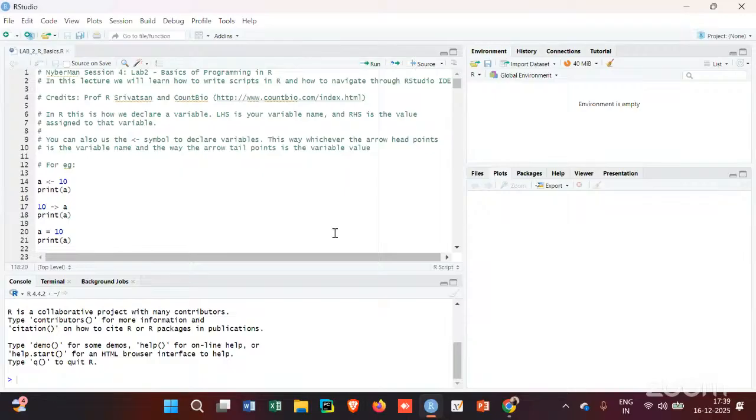This is just to familiarize you with R and the environment that you see here, this entire RStudio thing, so that in future sessions when we actually use R coding, because this is what we'll be using mostly when we perform the differential gene expression analysis, all of this does not seem too alien to you.